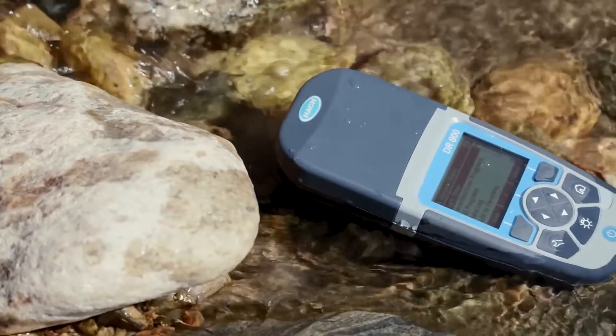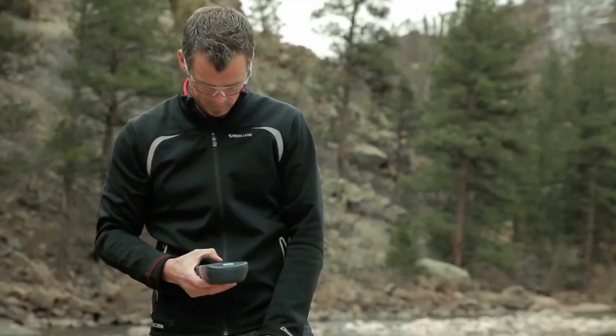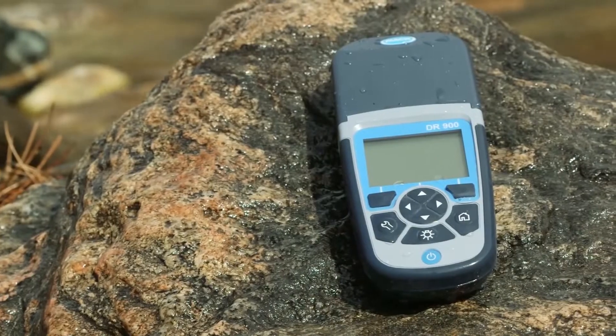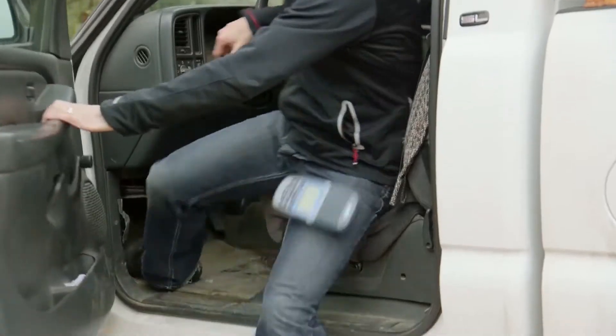The DR900 is built rugged for field use. You can test 90 parameters quickly and easily with one hand scrolling, and store data for a secure upload to your data management system. We know you need an instrument to test in the field, but often times the field will test your instrument.